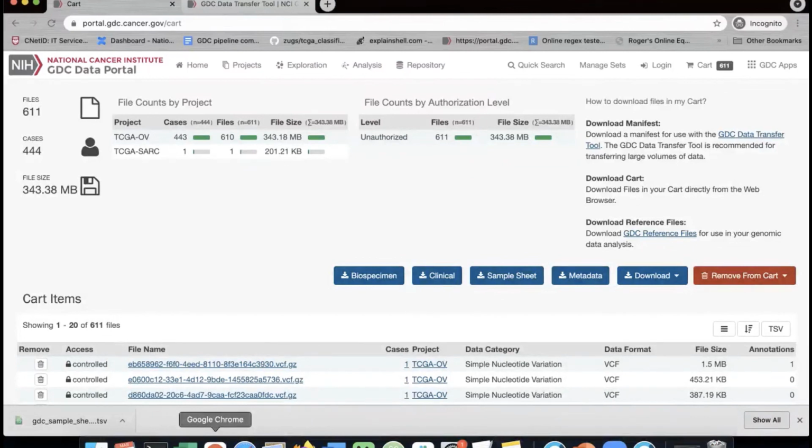Oh, okay. So they were remapped to the follow-up, but the idea there was that it's only named follow-up. Here it can be anything that will change over time. So theoretically, you could put somebody's BMI and they could have a changing BMI associated with date values. However, many groups just put no date and they put the BMI into the follow-up. In that case, that would just be the same as putting it in the exposures. We were doing that to make the data model a bit more flexible.